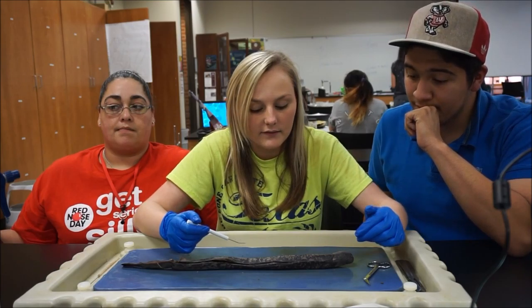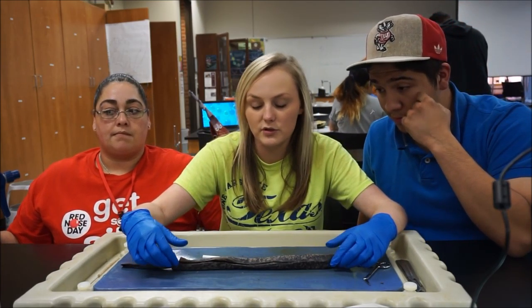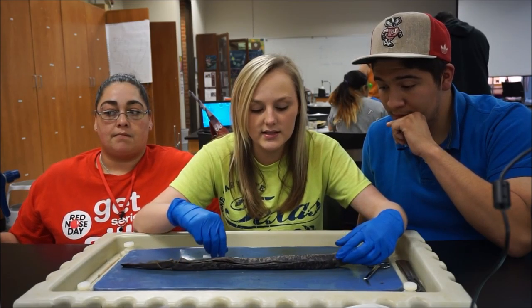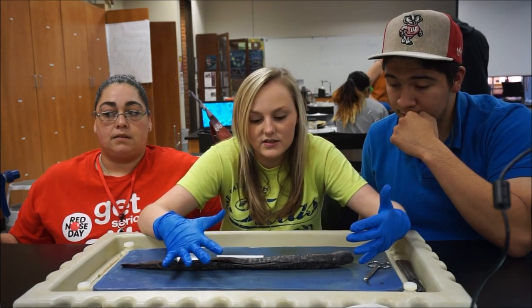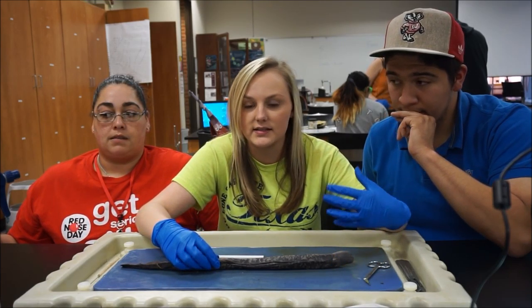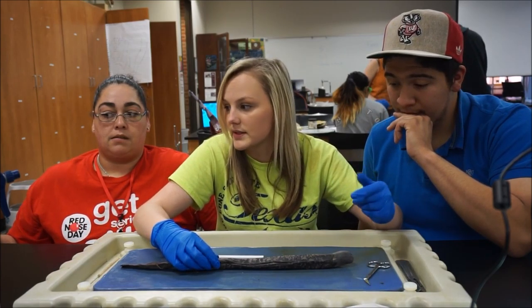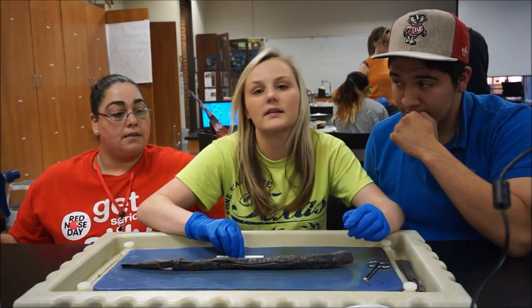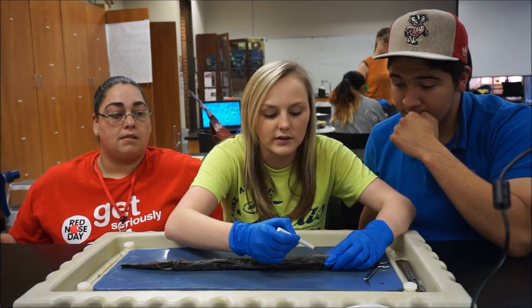Within the subphylum Vertebrata, since this is a lamprey, it is part of the Petromyzontida group, or subclass, which is characterized basically by its suctoral mouth. It has rasping teeth inside of it, and it has a nasal sac that isn't connected to the buccal cavity, which is basically the mouth. And it has seven pairs of pharyngeal slits, which are basically its little gill slits right here.